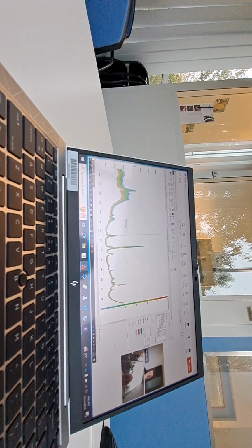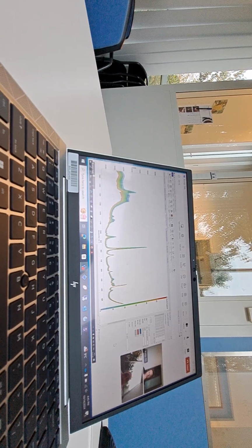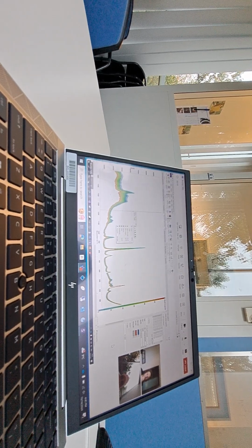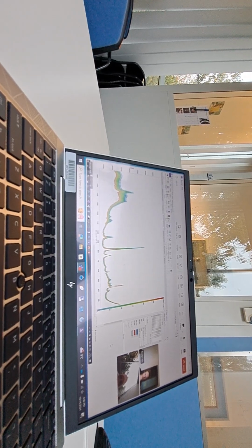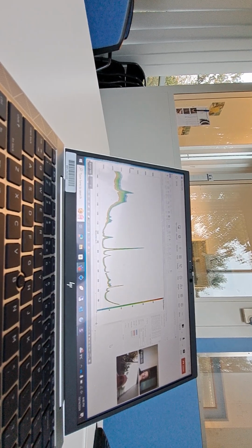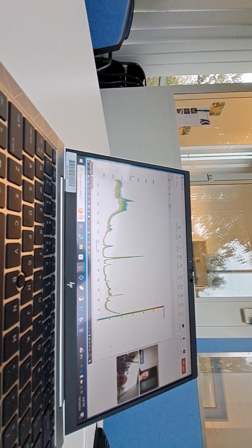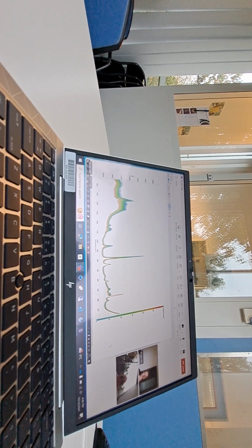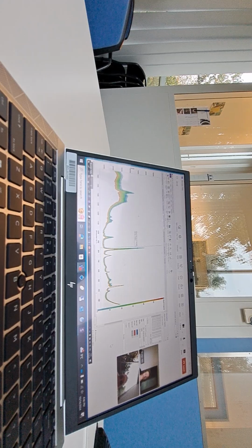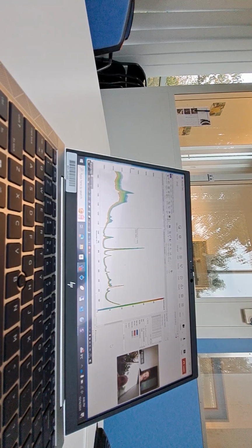Yeah, and most of the time, if you copy paste to a presentation, you could do right click, copy, but most of the time it changes a lot. So most of the time I use the snipping tool. I just do this. You see, and then I have a better picture. Most of the time I do it like this. So yeah, try some stuff, and then we can have a look.